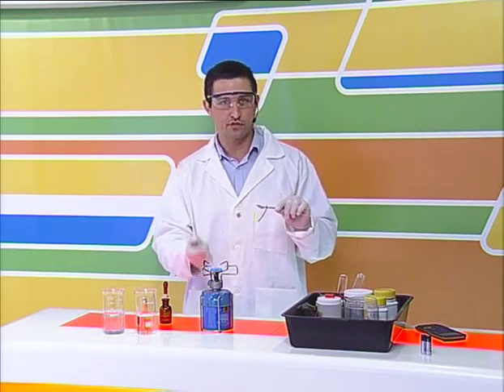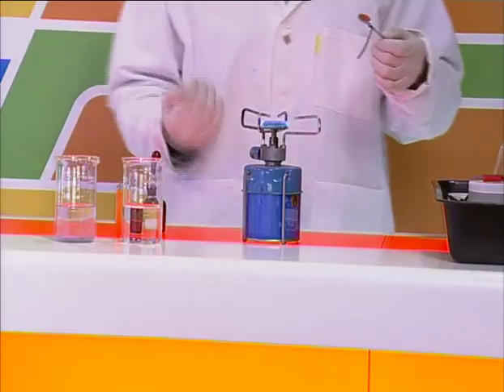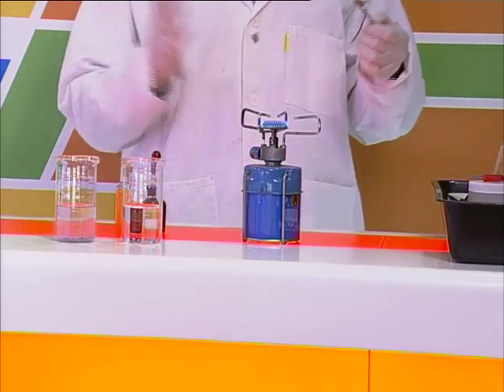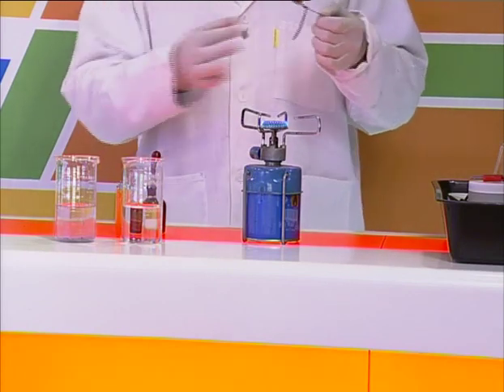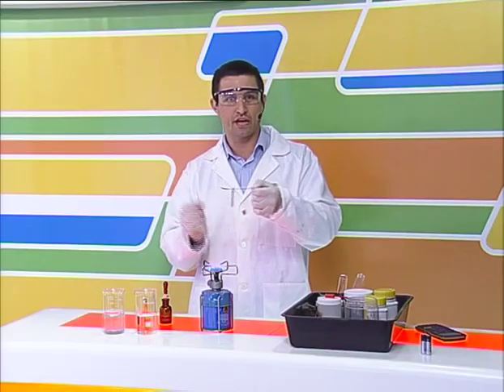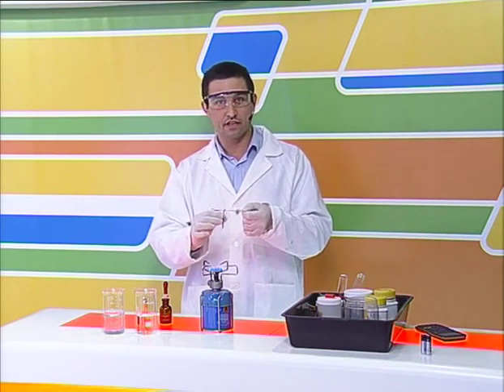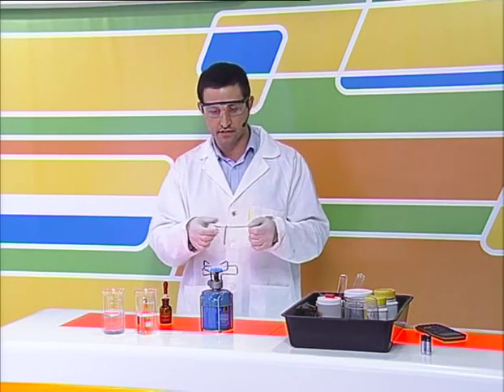So I've got a heat source over here, the very nice hot burner, because you can't just do this with a lighter. As you notice, I'm wearing some protective clothing here. I hope I don't burn the studio down. But I've got a little ribbon of magnesium metal over here, and magnesium metal combines with oxygen in a redox manner. Now, what redox means is that they're going to swap electrons, and something quite exciting is going to happen.